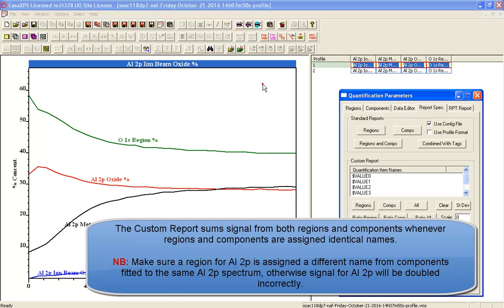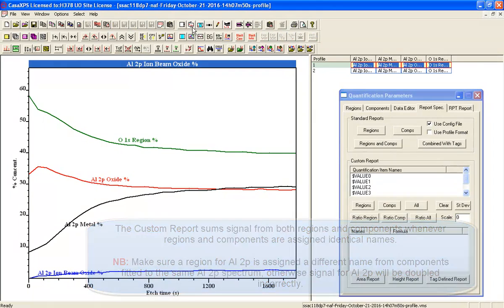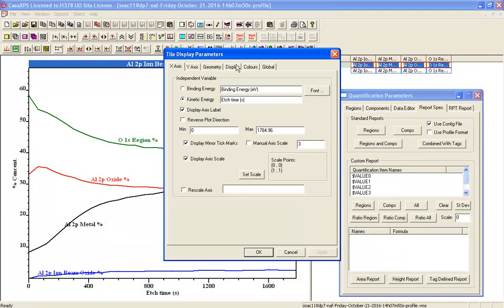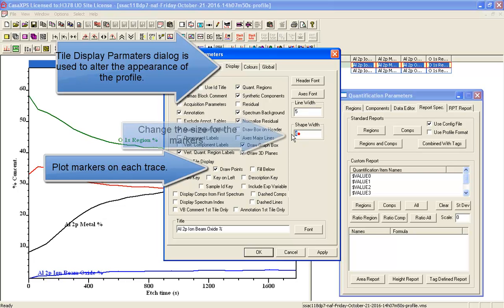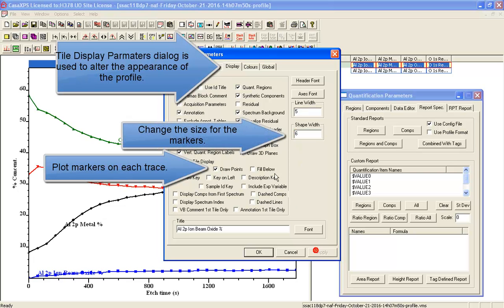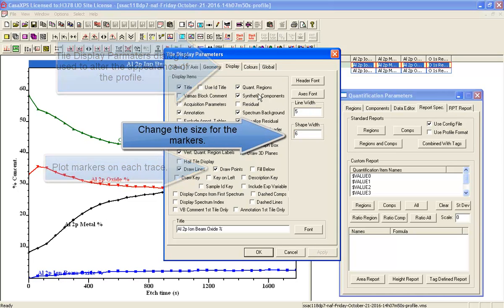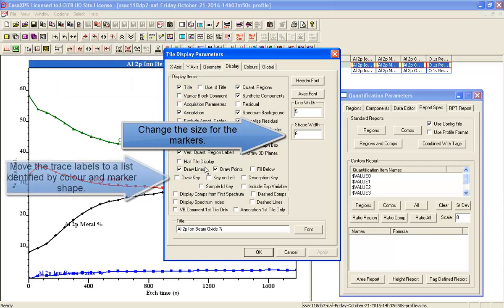The Al 2p Oxide is from two components, the Al 2p Metal from two components, and then there's some kind of Ion Beam Oxide that is just a single component in this depth profile.